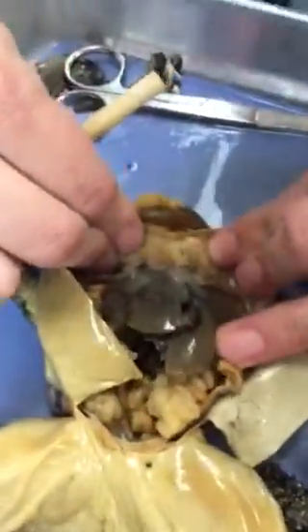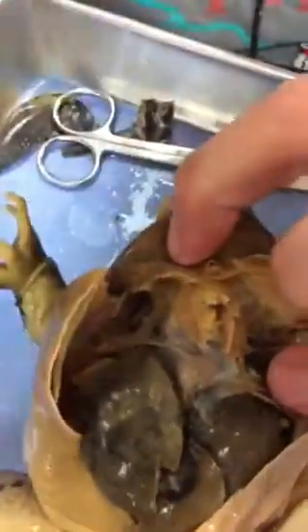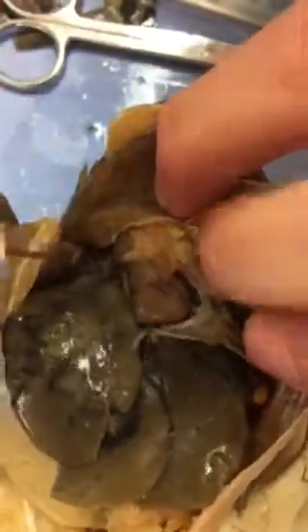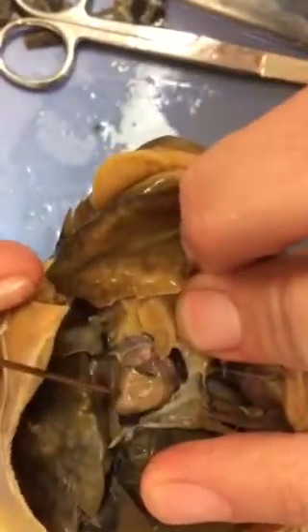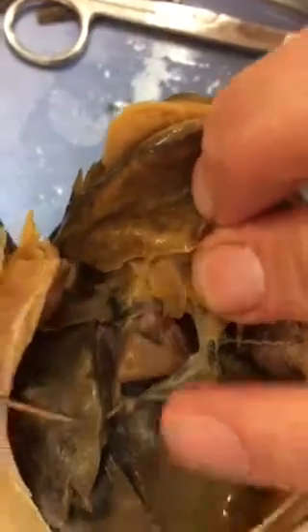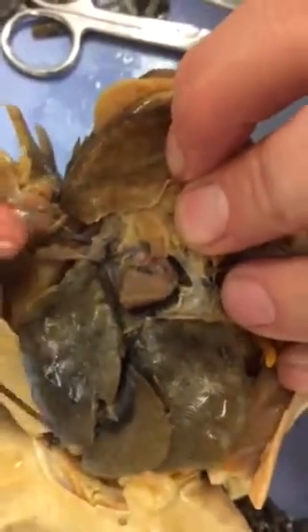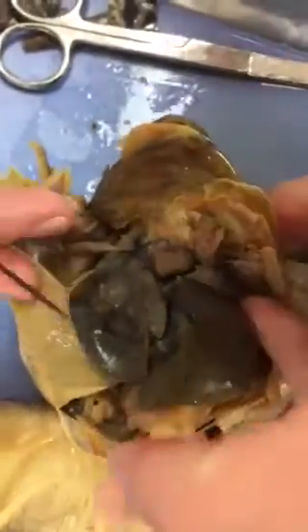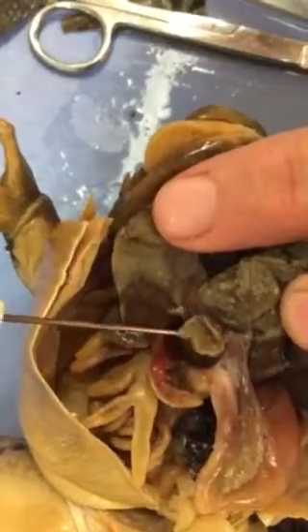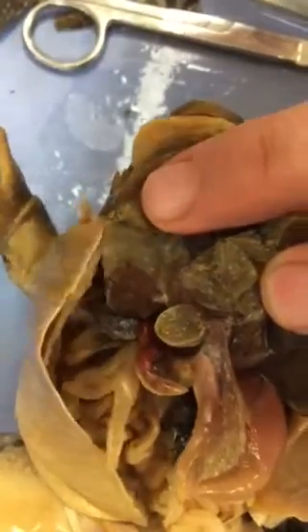Going inside, start with the heart up here. And so on the heart, oh, yours still has some film over it. And so we have the V portion, or the bottom portion of the heart. Here we go. This is the ventricle. And then above that, you have the two atriums. Then you have this big structure right here, which is the liver. Underneath the lobe of the liver on his right-hand side, you should see the gallbladder. The gallbladder is this little flat pea sac.